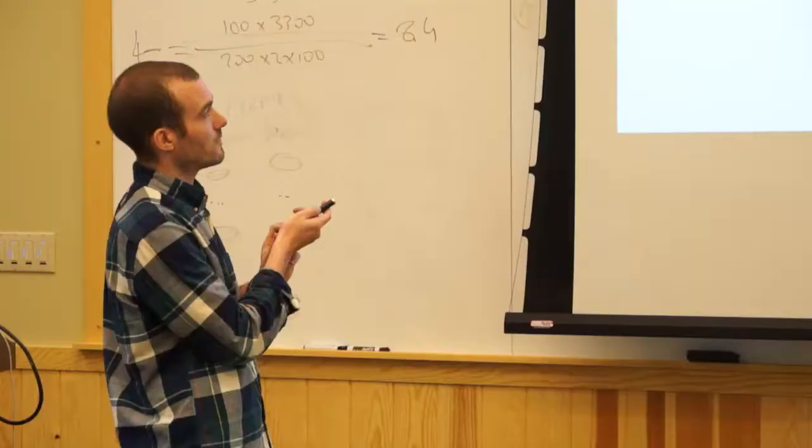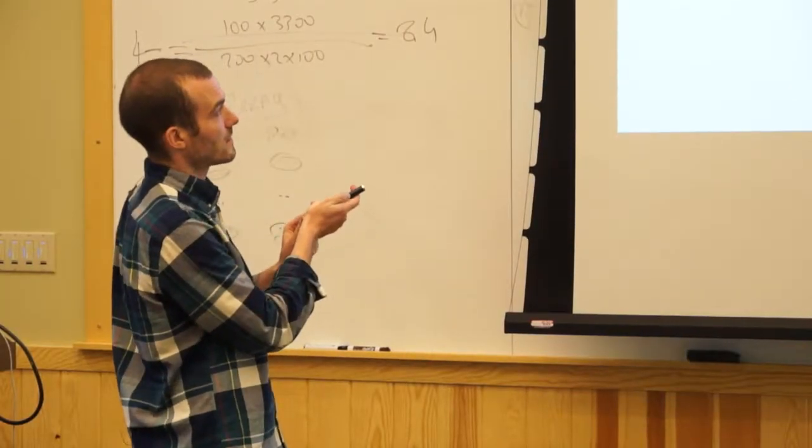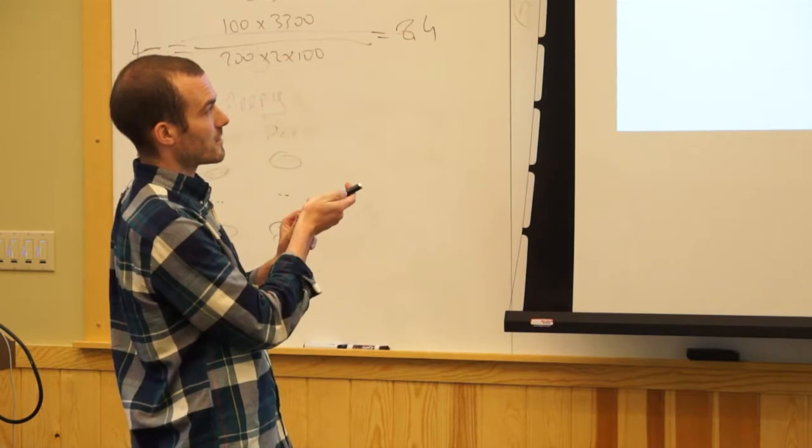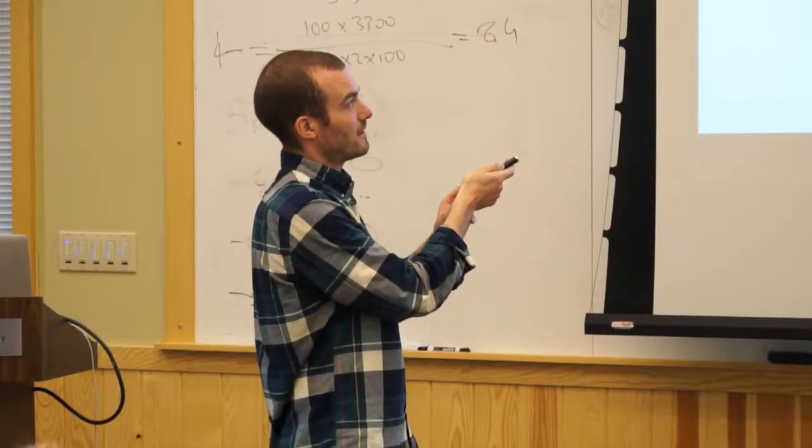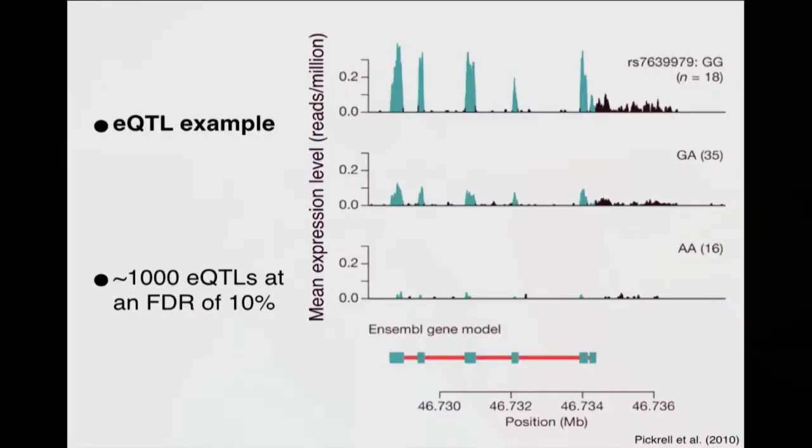So what I read this as is there's probably another transcription start site here. My reading of this was that there's an alternative transcription start site here. Black is not annotated transcription, and so my reading was there's an unannotated start site here that has lower expression.